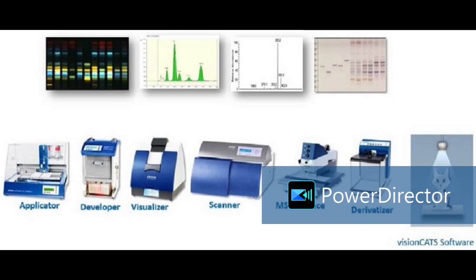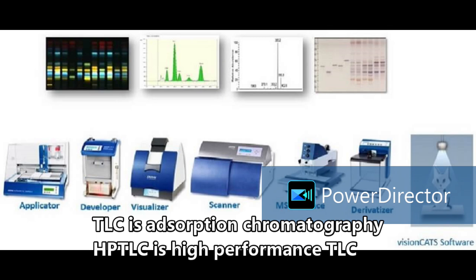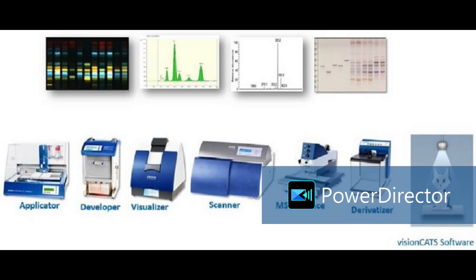So the basic principle of HPTLC is based on normal TLC. You know the principle of normal TLC? What is the principle? Adsorption. It is adsorption chromatography, and most of the time normal phase chromatography.